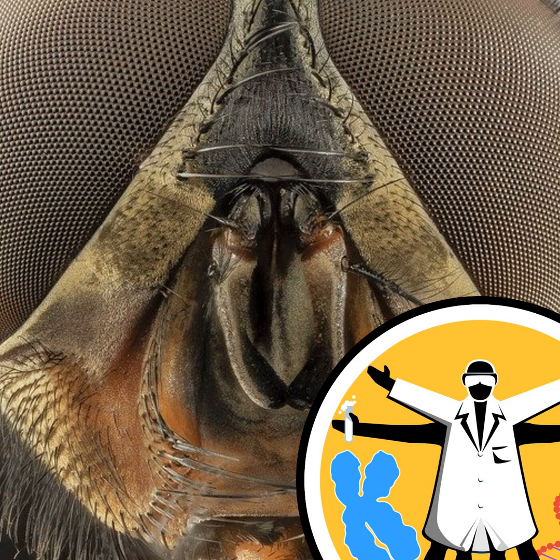When we compared the whole fly and the exterior fly samples, we actually found that chicken DNA and a species of fish were enriched in the sample that had come from the mashed up fly rather than the exterior, which might point us towards what they've been feeding on. Okay, right, so at least now we know what to go and look for.